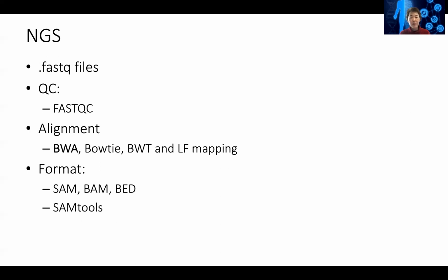And the very first step you might want to do is quality control. And we discussed FastQC. This is irrespective of whether you are sequencing DNA or RNA. You can always use FastQC to generally look at the sequencing quality. Then we discussed alignment, right?